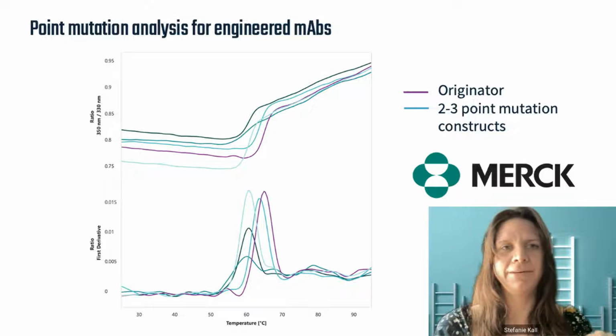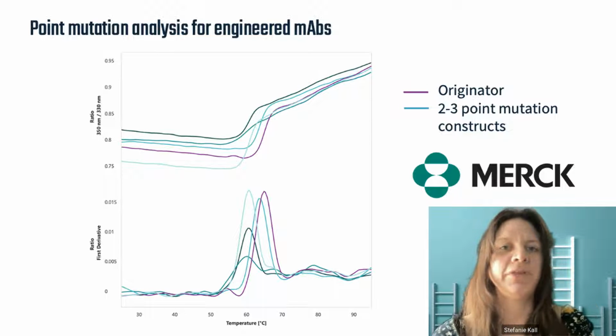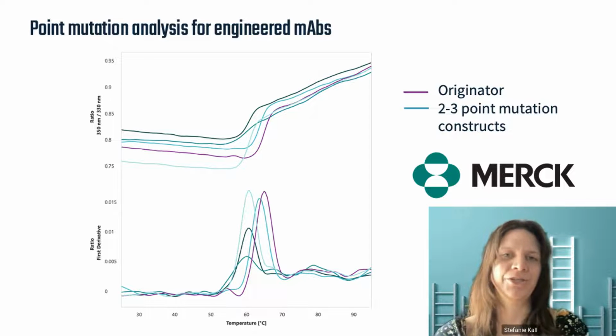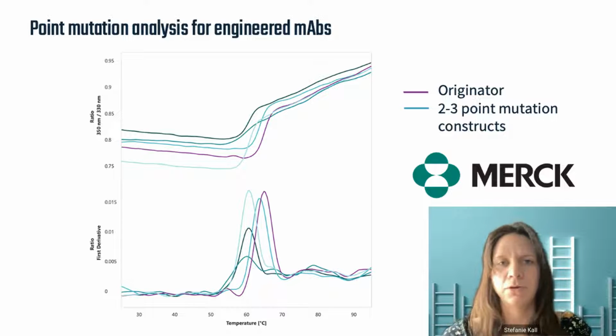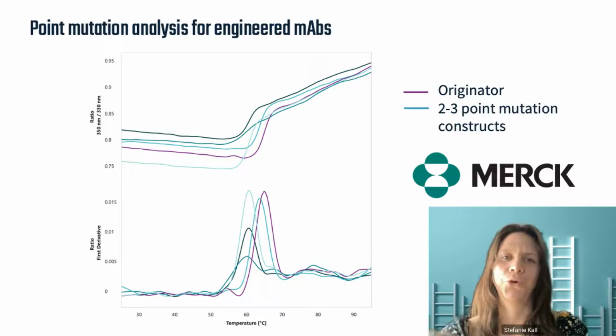Just pull up a slide. So here we're looking at a few different constructs that only vary by a few amino acid substitutions. You may recognize this data if you've watched Explore Prometheus Panta, Biologics Developability Assessment with 4 integrated technologies. My colleague Nathan talked about the data in depth there, including the other stability data measured in the same experiment, which Bridget mentioned earlier. But right now, I'm just going to have her really walk us through the unfolding curves here.